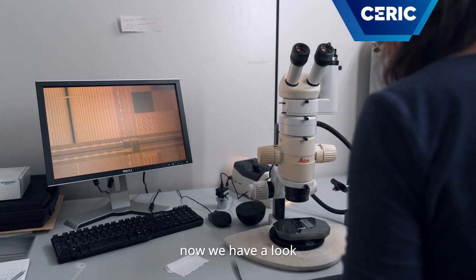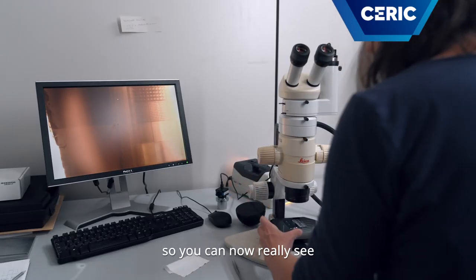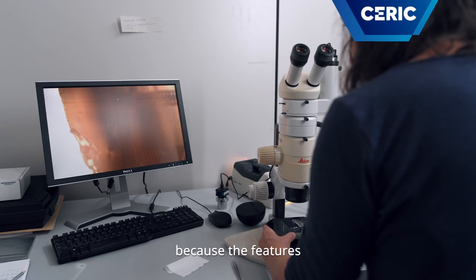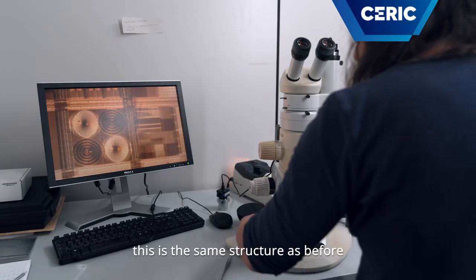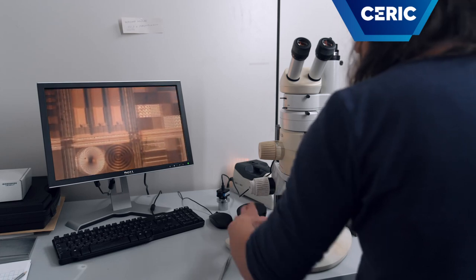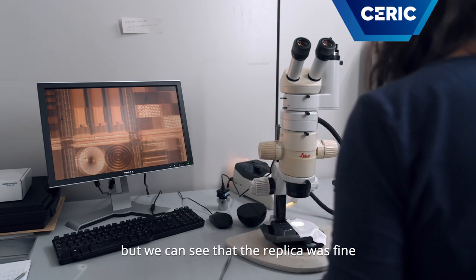Now we have a look at our replica. You can already see that the replica was good, because the features are the same. This is the same structure as before. It's not easy to see at the microscope because it's transparent, so there are some reflections. But we can see that the replica was fine.